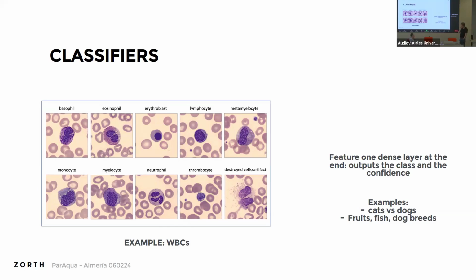So it's a little bit of a pain, and you may want to be able to make your slides and then put them on an automated microscope stage, scan the slides, and pull out only the entities that are interesting for you.